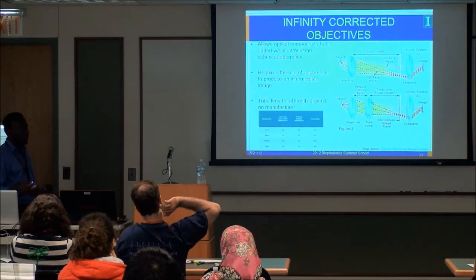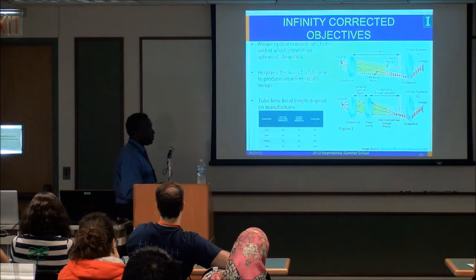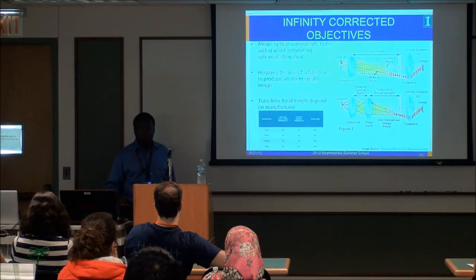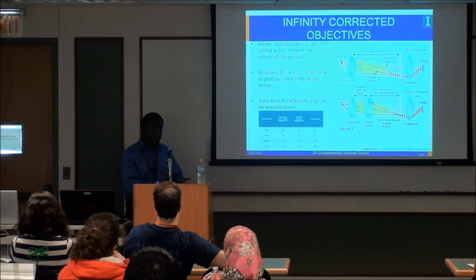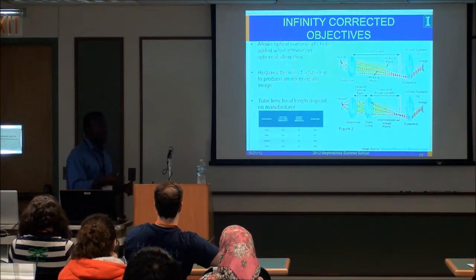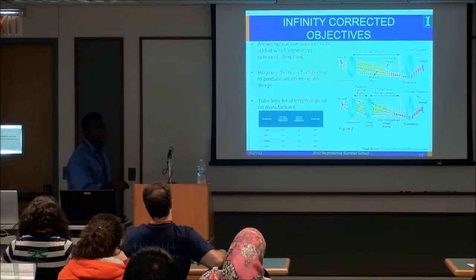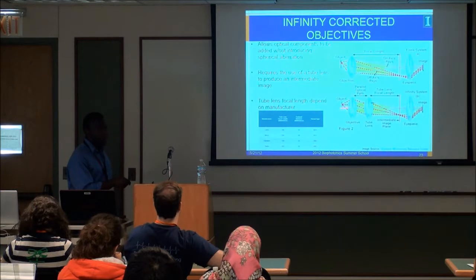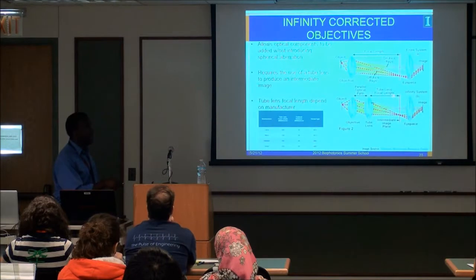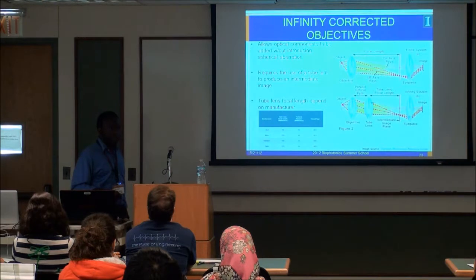Well, microscopy has become a lot more advanced since it was first introduced a couple of hundred years ago, and often one wants to introduce other optical components, such as polarizers, certain types of filters, and so forth, whether you're doing phase contrast or differential interference contrast or something along those lines. And you want to do that without altering the path lengths considerably, such that your image quality is still good at the output. So if you have a collimated region, you can introduce optics. And so people introduce what's called a tube lens so that they can get this thing back to an intermediate image plane and then the same optics at the output end.